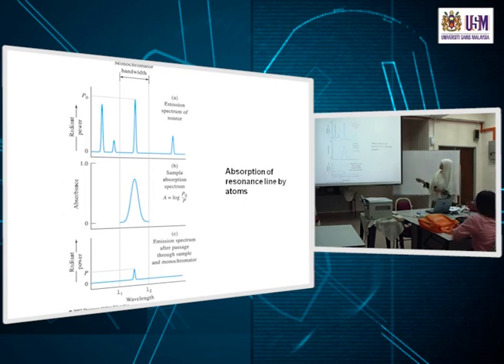So that's common here. It must be narrow. The bandwidth of your source must be narrow compared to the absorption profile of your atom. And why is the absorption of the atom broader compared to the source? The absorbing atom is copper, and the source is also a copper lamp, where copper atoms are emitting. Why is this line narrow compared to the other? Remember, in flame absorption, the atoms are formed in the flame at high temperature, so there is some broadening due to pressure, maybe. So usually the atom absorption spectrum has a width wider compared to the source it's coming from.